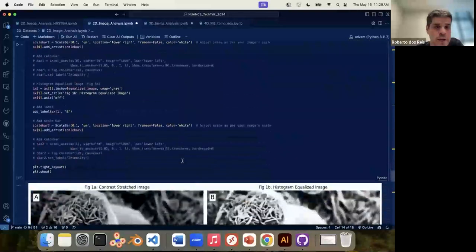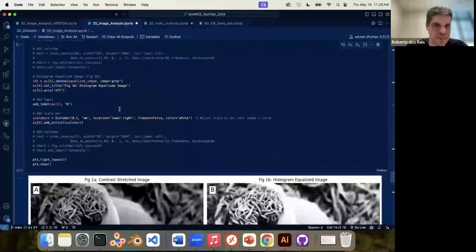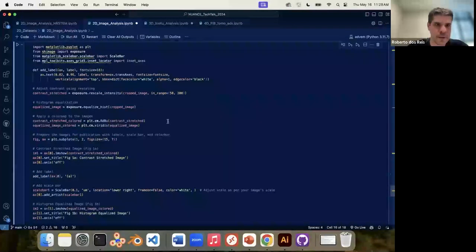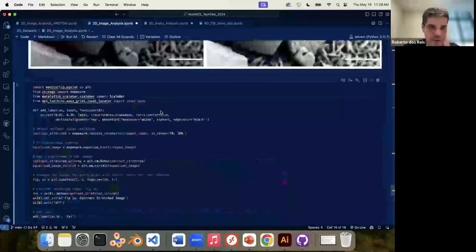So other things that you might want to do here that I show at the bottom is adding labels, right? I kept this at the top, but you can always remove it. And you might want to add this, right? This looks a little bit more publishable, I would say, with the scale bar. And perhaps if I change this one here, that would be probably ready to go for submission. So if I just take out the title here and take out the title from here, it should be fine. Yeah. And then I added 2 different color masks, by the way.